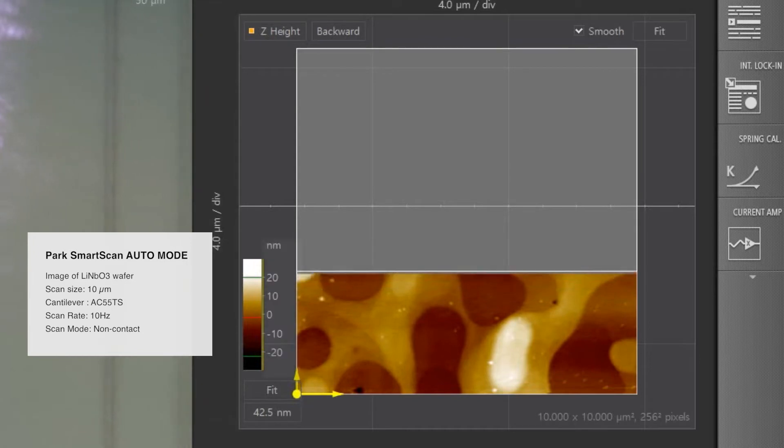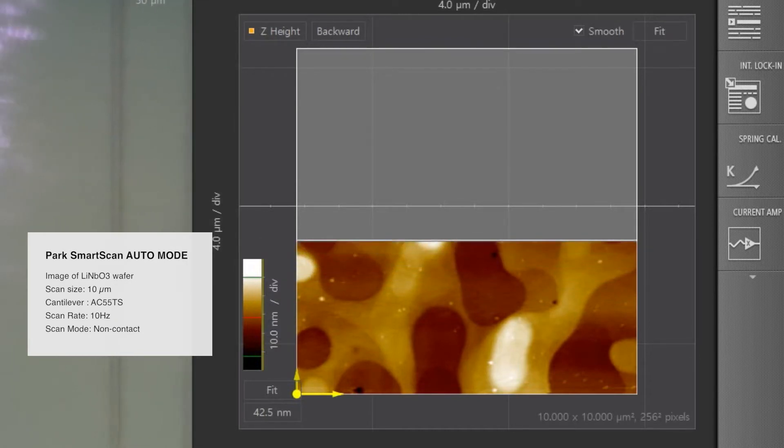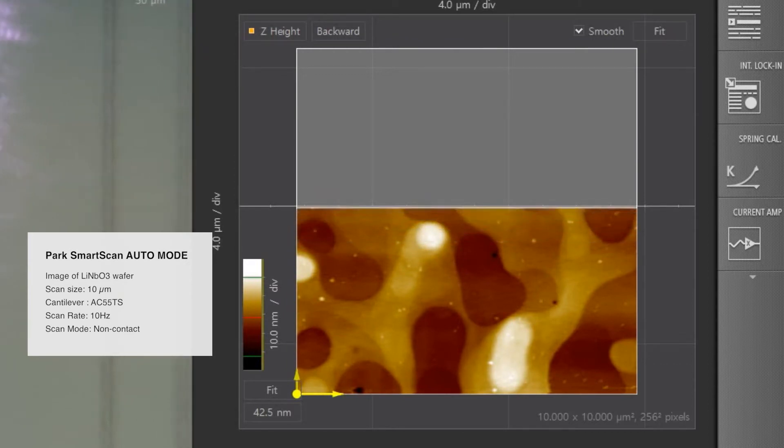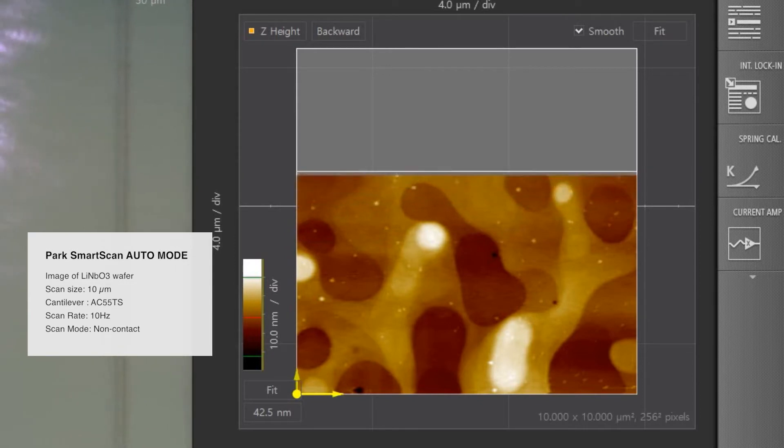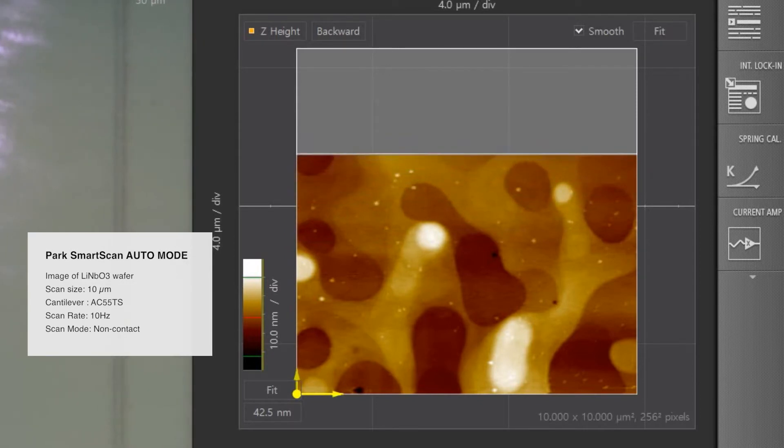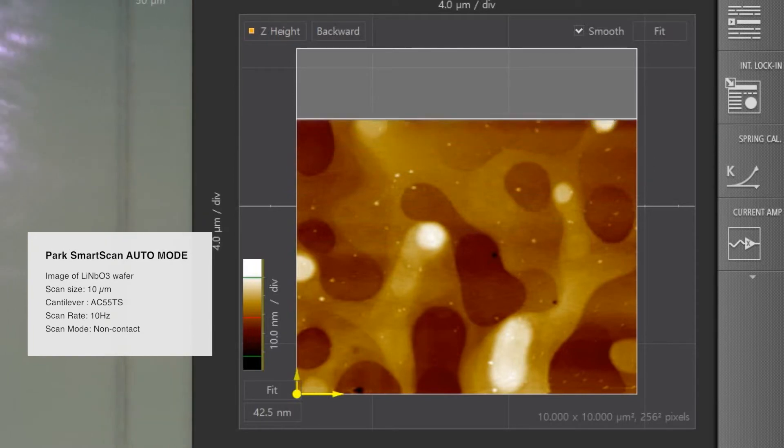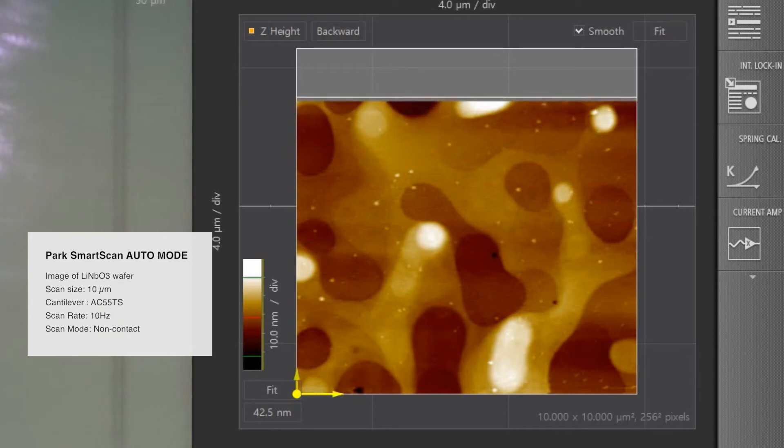Its non-linear optical characteristics enable communication with excellent electro-optical performance. The sample surface has a variation of feature heights on the order of 50 nm. It is being imaged at the rapid speed of 10 Hz to produce results which accurately detail its regularly arrayed features.